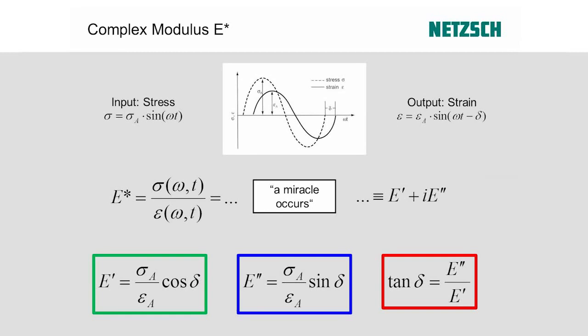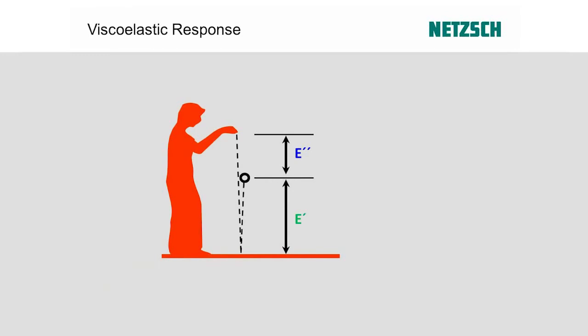different values. We now have to understand what this has to do with the viscoelasticity of our sample. So I would just refer to this experiment here. So you take, let's say, a rubber ball, and you just drop it on the floor. What will happen? It will come back up. And this is how the parameters are linked with the property of a material. The way the rubber ball comes back up is exactly proportional to the amount of stored energy and the spring-like response of our material, of this rubber material.